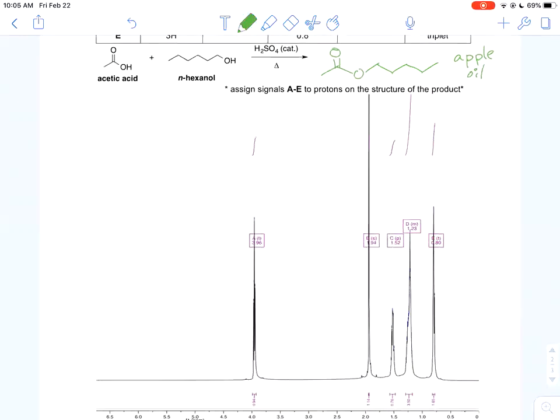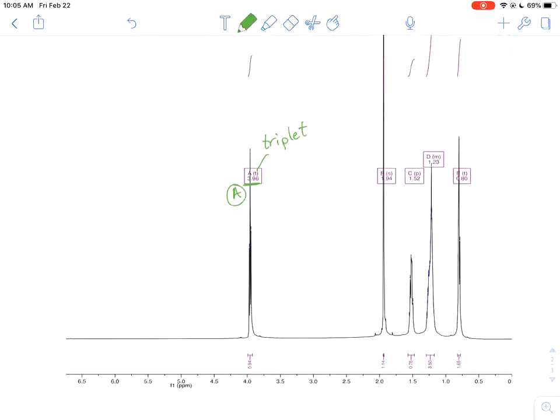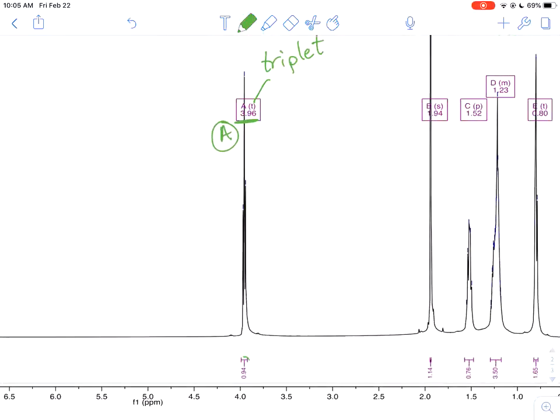What we have going on are some symbols. I just want to make sure this is clear. So this over here is signal A in case this was lost. And it's given, there's a T right there, that this is a triplet. And the chemical shift value was given at 3.96. The other thing that's given is this little integration value down below.